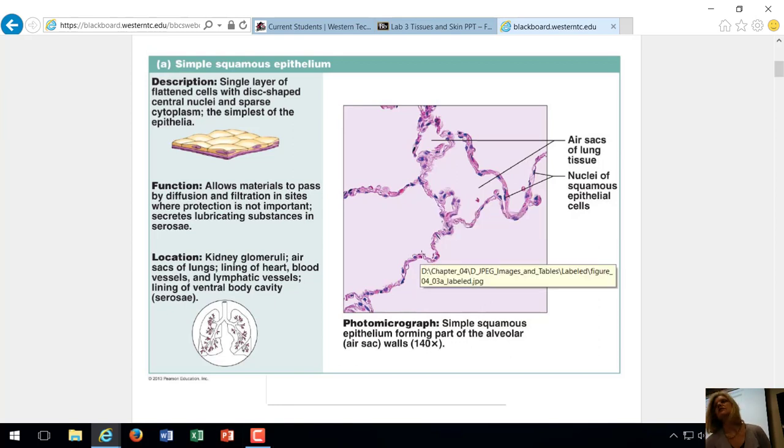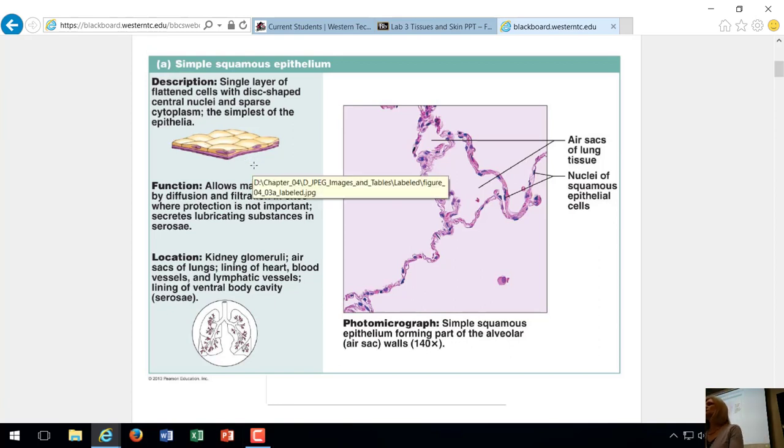This is a cross-section where it's just been cut and we can see this is where the air would be filling that air sac and this is the walls of the air sac. If I look at just this layer here, you can see they're flattened cells. Think of squamous like squashed, flattened cells. Rapid diffusion of things across this tissue makes this a very efficient tissue in the areas that it's located in.